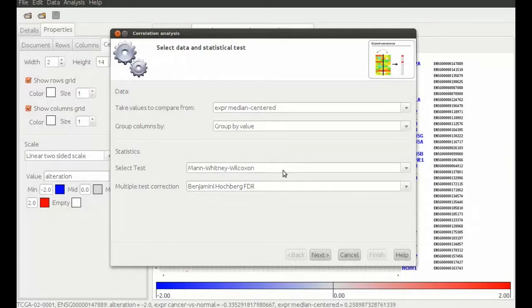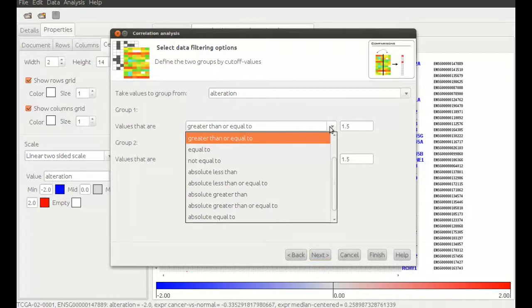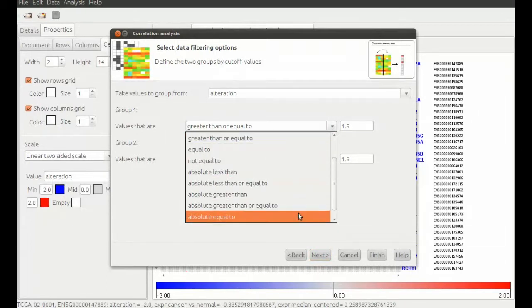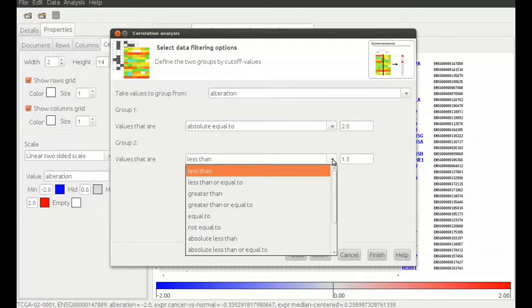On the second page we choose the values that separate the groups for each gene alteration. Alteration is designated by minus two or two so we choose our first group accordingly. Non-altered samples are designated by zero.